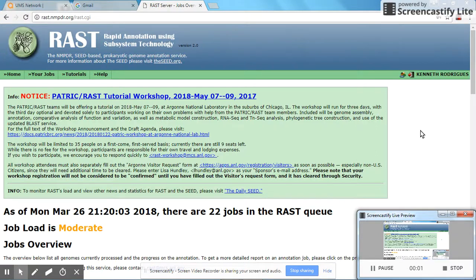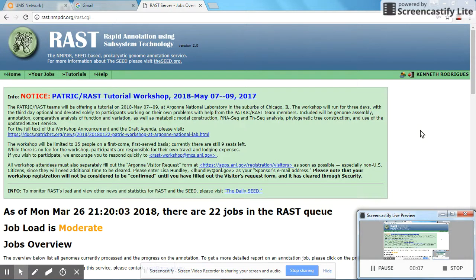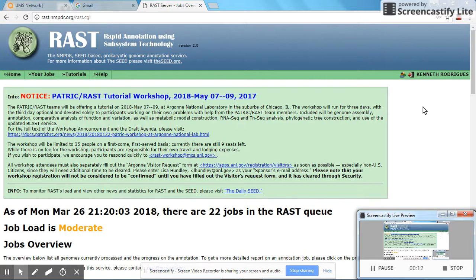Hello. This morning, we are going to introduce you to RAST, which is a rapid annotation using subsystem technology. This is a very useful tool to analyze microbial genomes if you have no prior knowledge of bioinformatics.